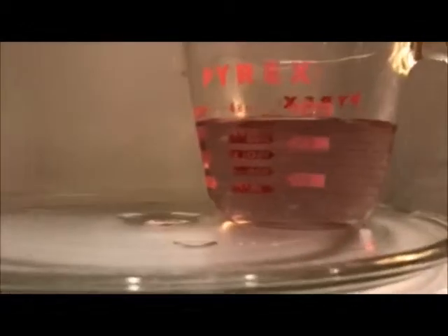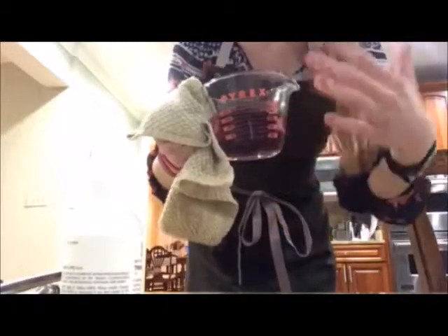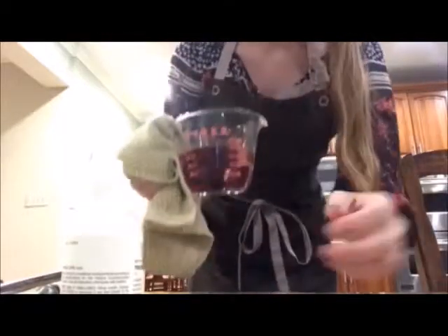You're then going to want to put your solution back in the microwave for more 30-second intervals. You will notice some changes that will occur with the color of the solution. The solution will be very hot when you take it out, so it's very important that you do not touch it with your direct skin. You use a rag or a hot hand to touch it instead.